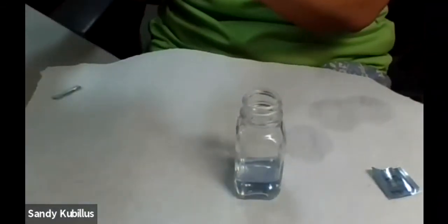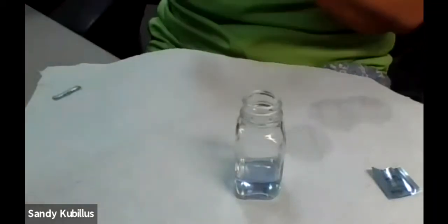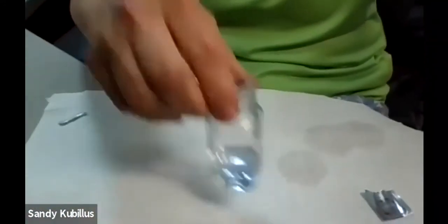It's 12, and I believe, based on this chart here, we need to multiply by 20. So that would be 240 is our hardness. Remember I said 180 is hard water. So this is 240, and I believe it was the Des Plaines River one. So you can see that is very hard water.